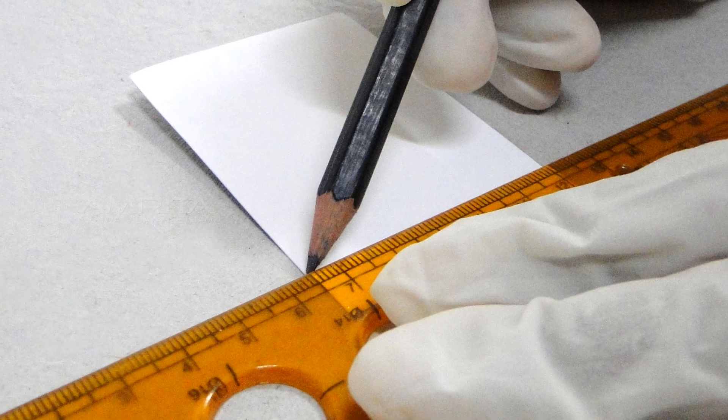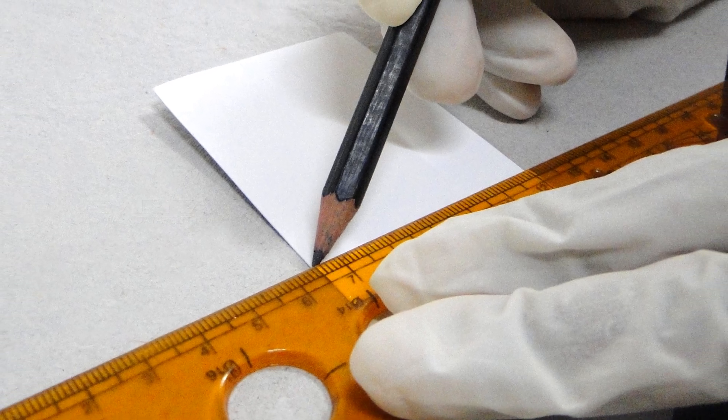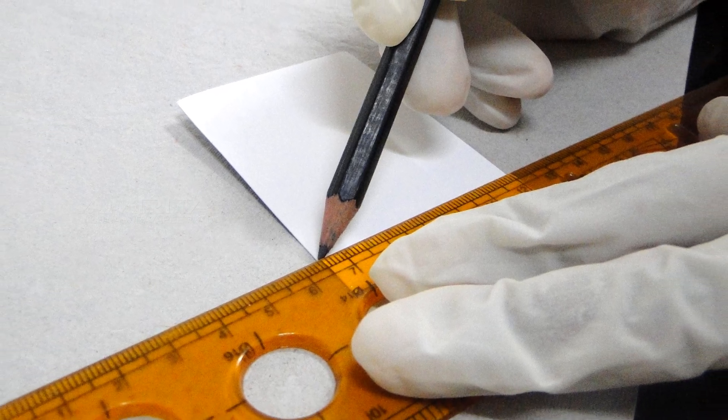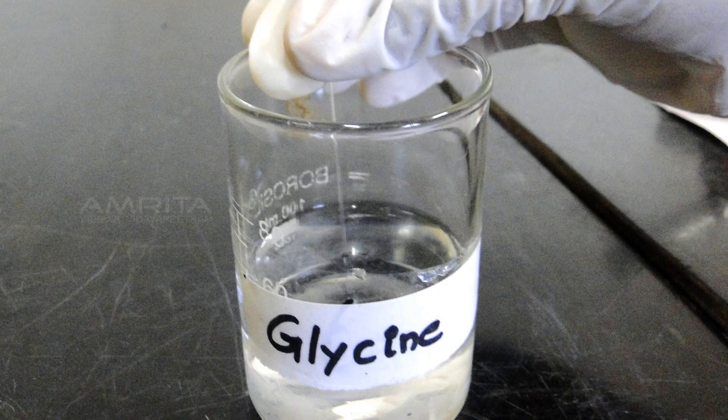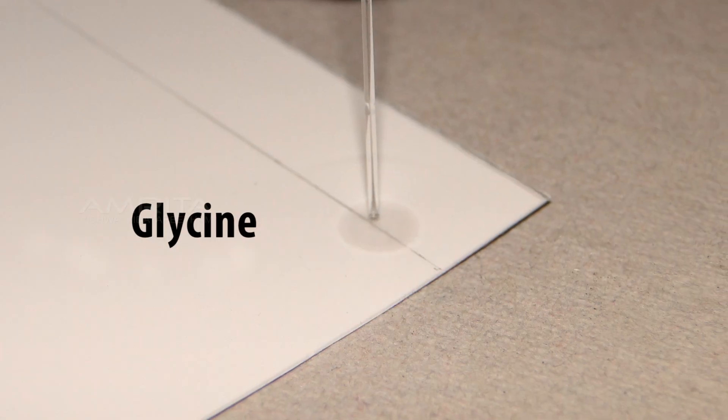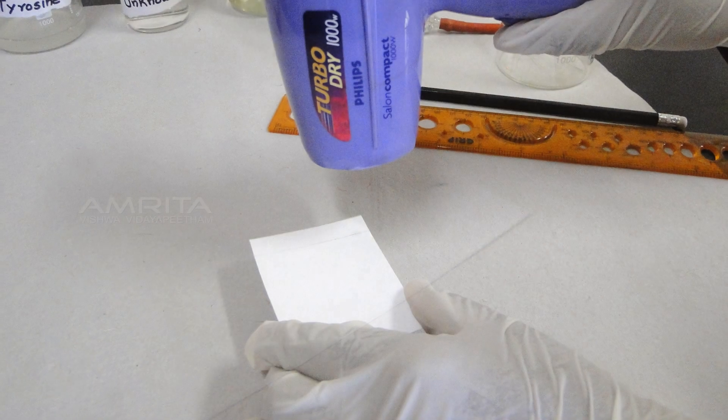Procedure: Cut the plate to the correct size and using a pencil, gently draw a straight line across the plate approximately 1 cm from the bottom. Using a capillary tube, a minute drop of amino acid is spotted on the line. Allow the spot to dry.